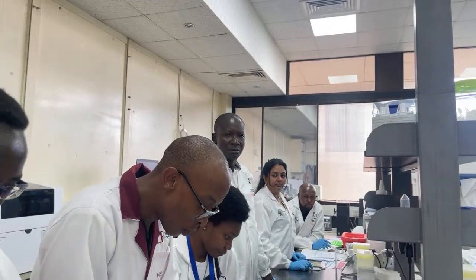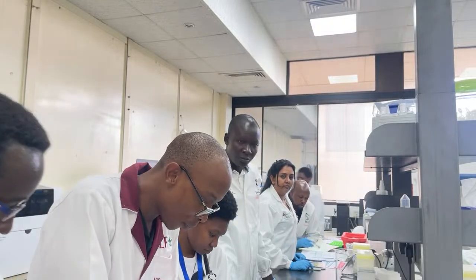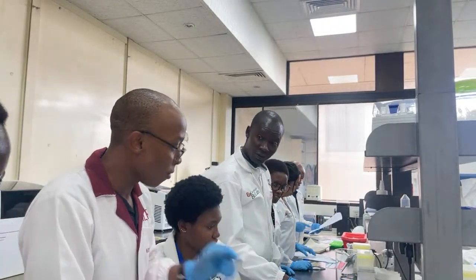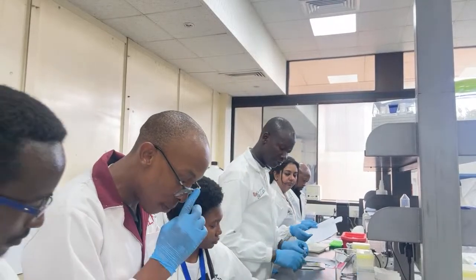Okay, next step. So you're going to do a short spin again, just to collect. Yeah. Short spin the column, just like we did before. Short spin, and we move to point number 20.